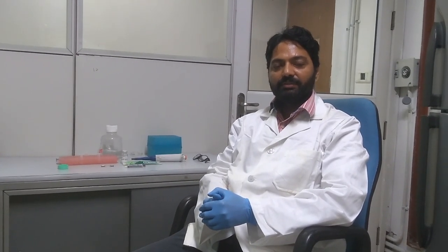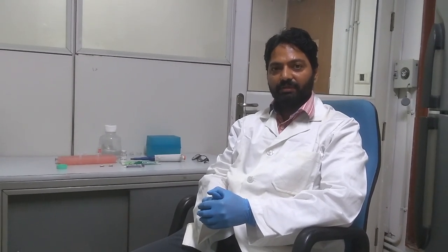I work in CSIR, and in today's demo, we'll be discussing the different steps involved in the generation of antibodies in rabbits.